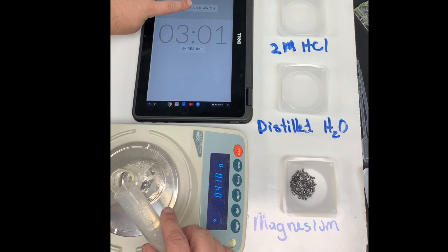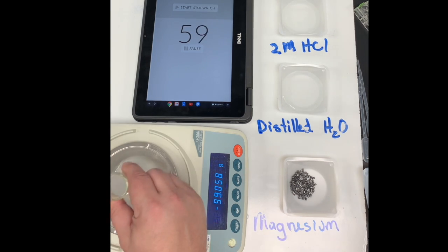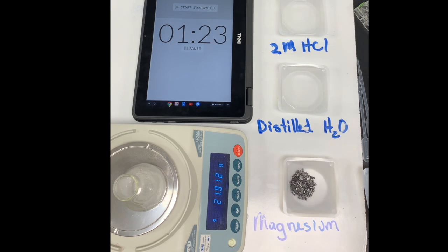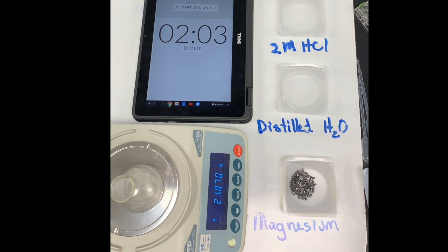I'm going to start the stopwatch and add the acid, and we'll let it go for three minutes. Every 30 seconds, I'll take and give it a swirl to make sure that it's mixing well. All right.